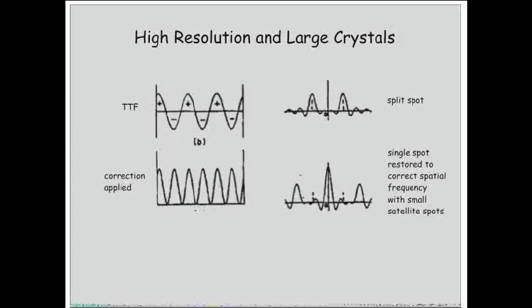The reason they're twice as far out is that the number of oscillations is twice as many now. So we're twice as far out, and we're recovering that central peak. Now we can go and measure the amplitude and phase at that peak where it's been correctly restored. In principle, you're multiplying the whole image by that tilt transfer function, so you've got to get an estimate of what the tilt transfer function is. In practice, the whole calculation is done in reciprocal space much more efficiently, and you do a convolution in reciprocal space rather than a simple-minded multiplication in real space.